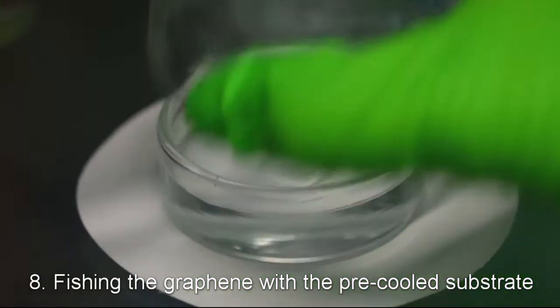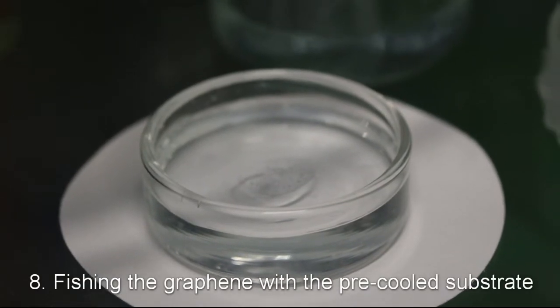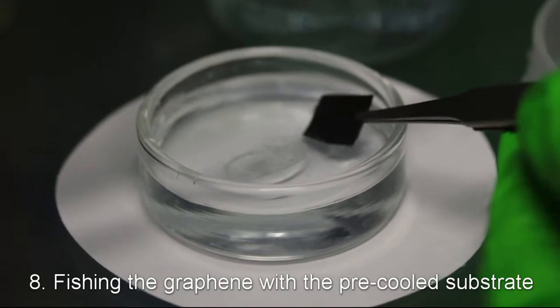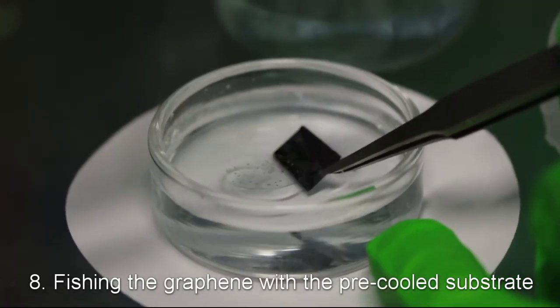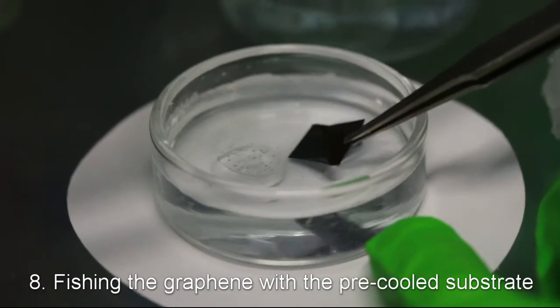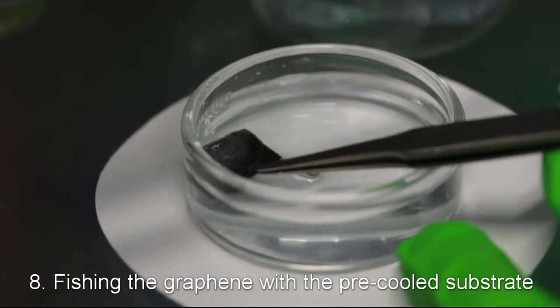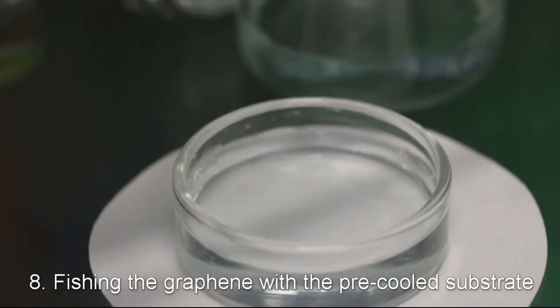And then we do the transfer. We take the substrate, in our case it's a silicon wafer, and the tweezers that were preliminarily cooled down and fish the graphene with cyclohexane from the bottom. This step can be done in many different manners, but we found this one the simplest and suitable for most substrate types.